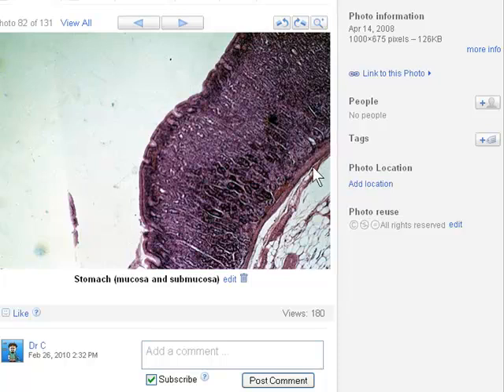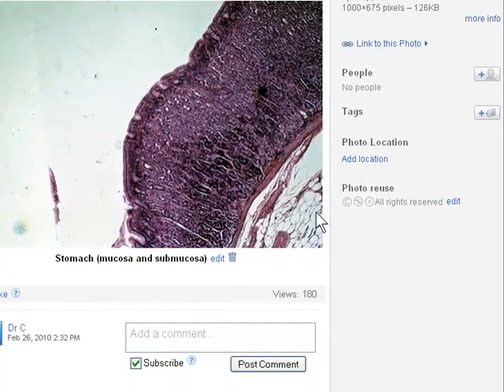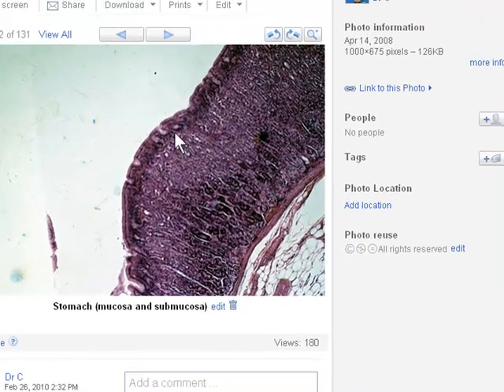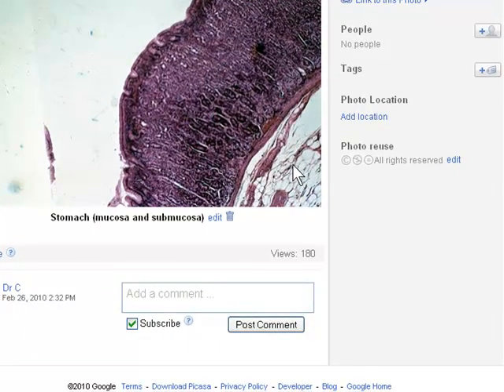But they invariably get confused with this muscular layer here, the very thick muscular layer that's just deep to the tunica mucosa that we see right here. Okay? So be aware of that. So we've got mucosa, dark purple layer. Submucosa usually has a lot of space in it, a lot of different types of tissues, including blood vessels, lymphatic vessels, etc. And then we have the tunica muscularis.